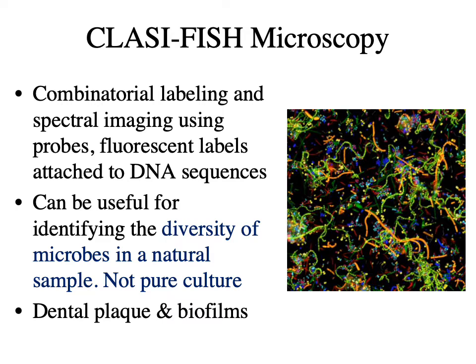In your mouth, you have over 700 different types of microorganisms present. And there can be numerous microorganisms present in a biofilm. CLASI-FISH can give you this very colorful image of all the different types of microbes that are present so that you can see the overall diversity of that sample.